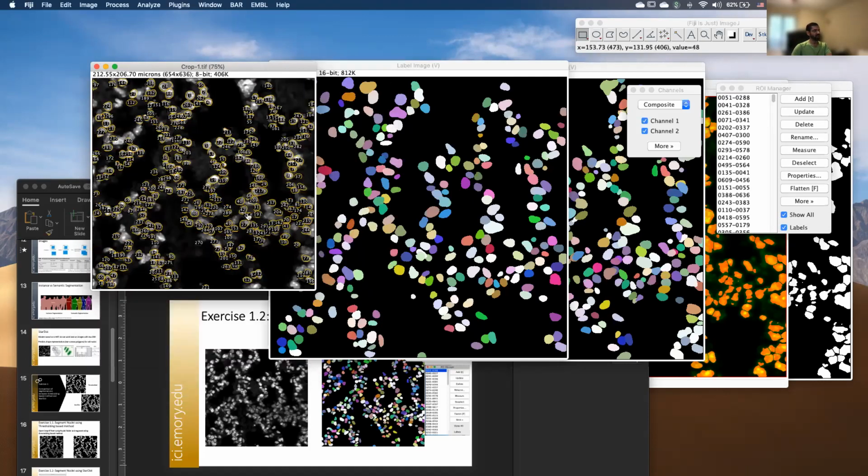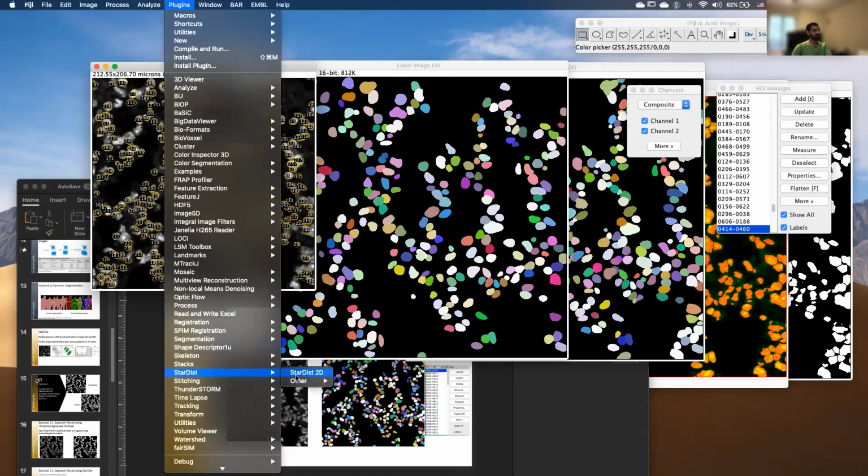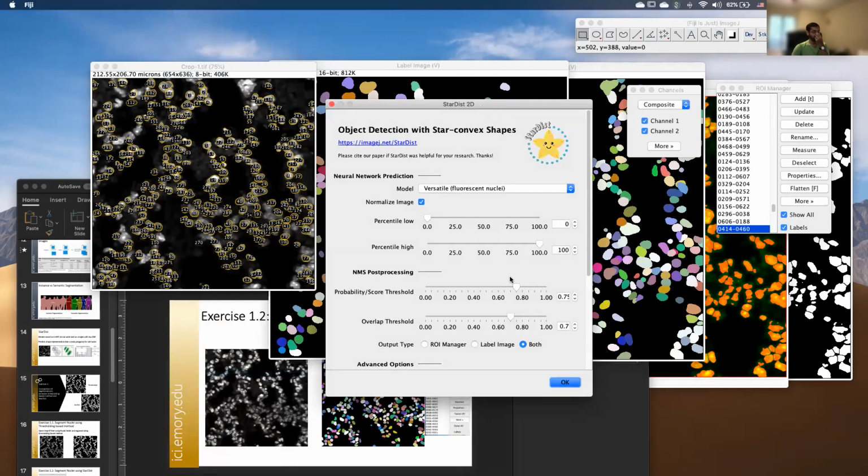So this is where you have to play between these values and see what works best for you, okay? So I'll let you play with this and come to a satisfactory point, which is sort of a happy medium for you, okay? So play with it, come to a happy medium.